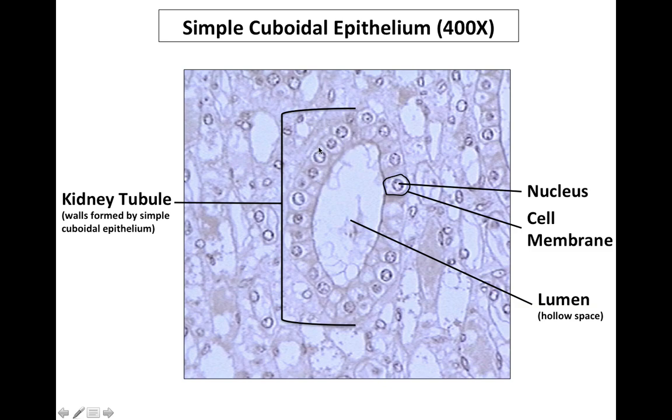You also note that because it's epithelium, one side of the cell here is going to be bordered to connective tissue of some sort, while the other side is exposed to whatever is in the lumen. Great representation of epithelium right there.